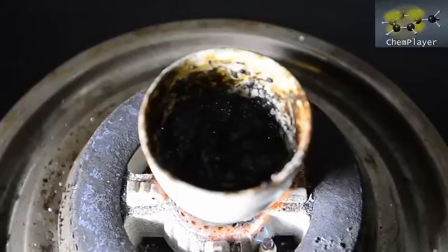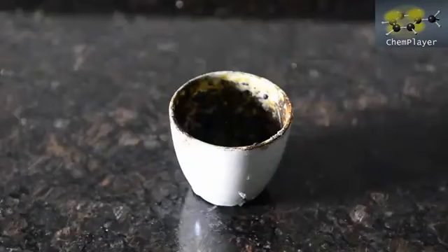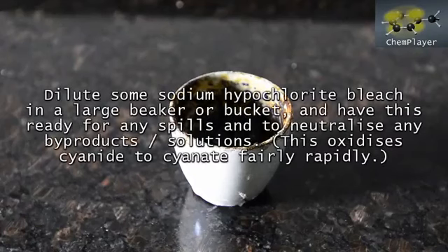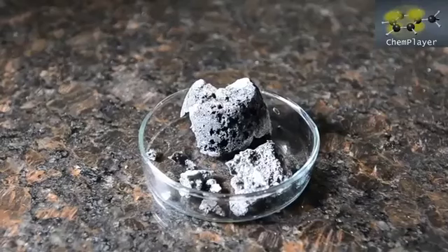And once it melts in about 30 minutes, you're done. Allow to cool completely, and protect from air if you can. Remember that this is now live and deadly. So from this point have a bucket of diluted bleach standing by, and full protective gloves on.